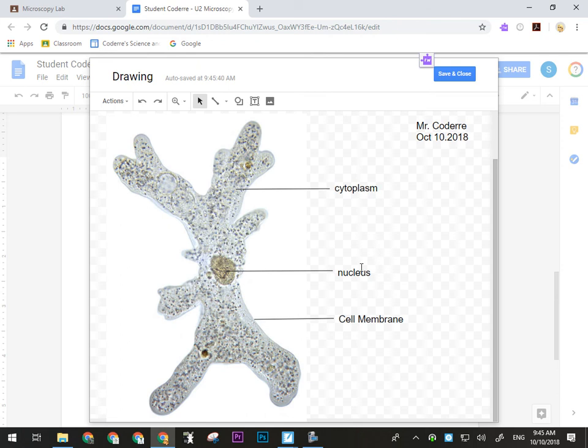Okay, so now I've got my diagram built. What do I have to put down below? I still haven't put in my title and my magnification and all that. You can just use a U to represent mu because it's a pain in the neck to find the symbol. So just use a U. It looks a lot like mu. So that's 350 micrometers. All right, so now my lab diagram is done.